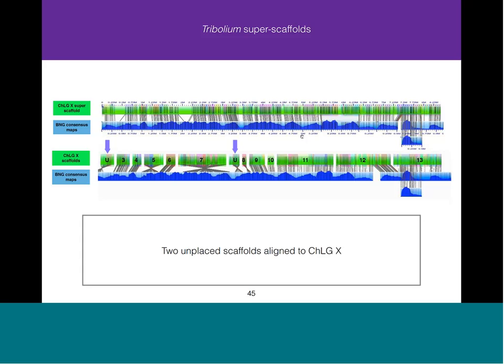Okay, great. We still have more questions, so let's do a couple more here. The next one is, have you by any chance validated the gap size inferred by the BioNano Maps versus your reference genome? Yeah, no, that's what we're doing right now. We're evaluating them at the sequence level, and we're hoping that for the ones that are very small, we can detect them using our long-distance jump library.